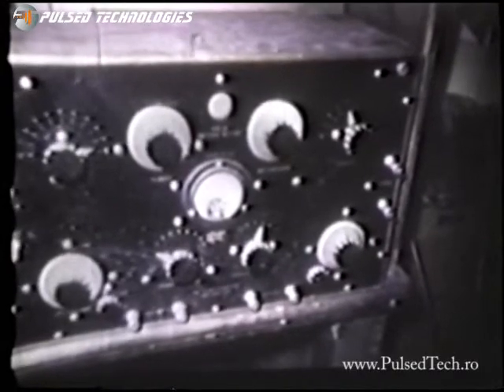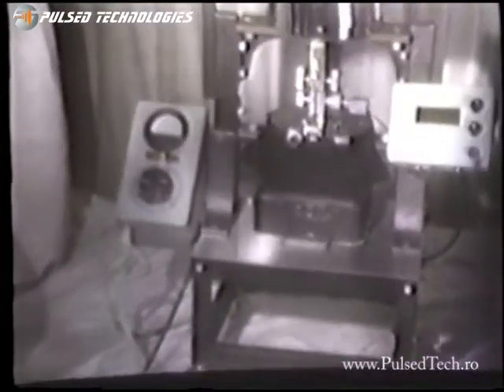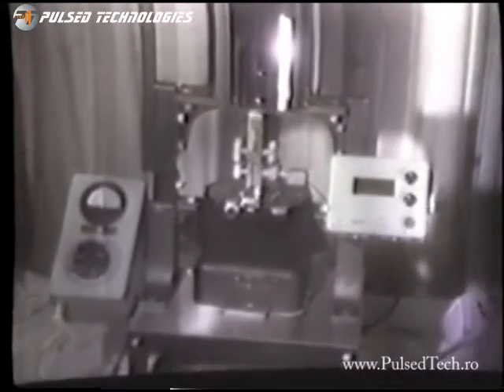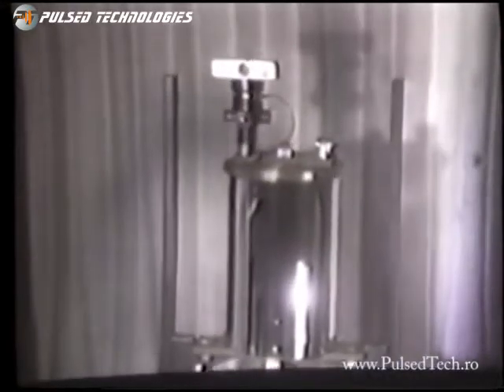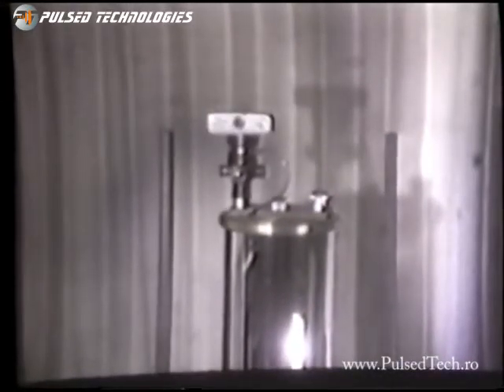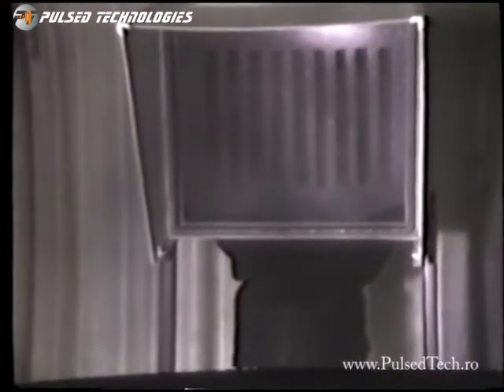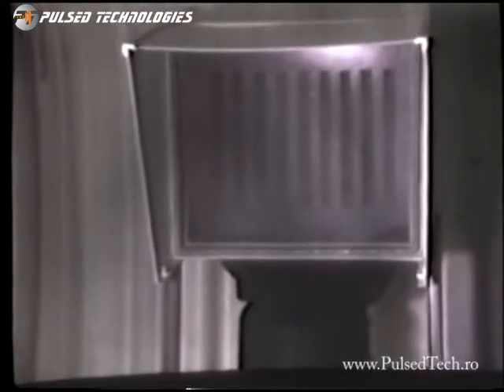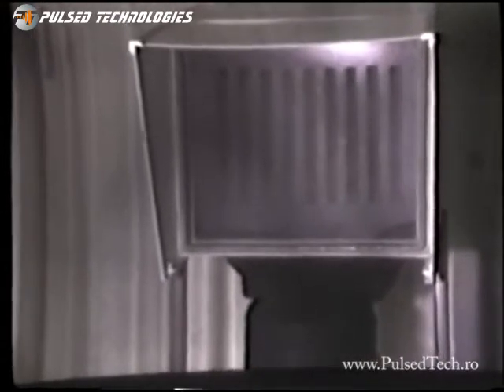And these instruments were built by Kennedy of San Francisco in 1920. This microscope I designed and built for projection of the viruses, bacteria, and worms and so on on a slide 10 feet away. It also has a front screen, on which you can see the ruled gratings being projected.